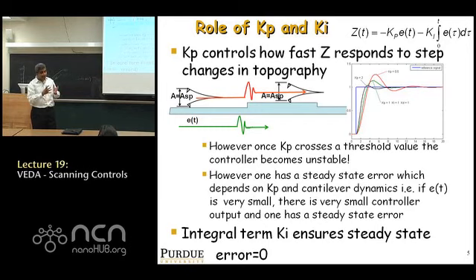And in AFM systems, you can actually hear that instability when you image. If your proportional gains are set too high, you sometimes hear, at least I think I can hear, a noise. The reason you can hear the noise is that this unstable up and down motion happens at a low enough frequency that you can hear it. It's really interesting, and when you change the proportional gain back to 0, the noise goes away. I don't know if you've had this experience, but the noise you hear is not the cantilever oscillating, for sure, because that's happening at very high frequencies. If you hear a noise, it's got to be a low frequency thing. The only sustained oscillation you get at low frequencies is due to the instability of the PI controller.